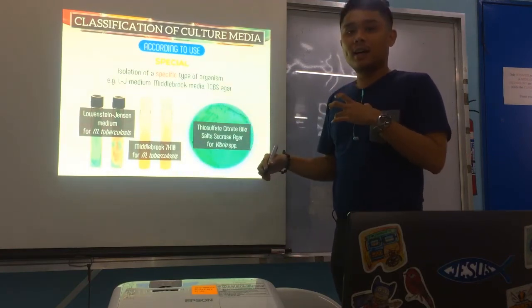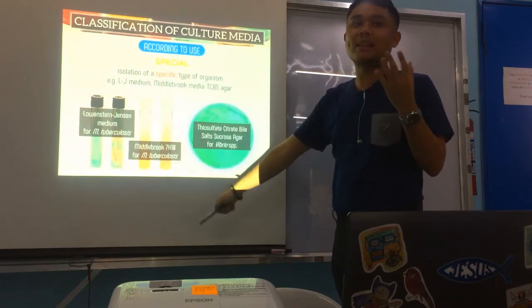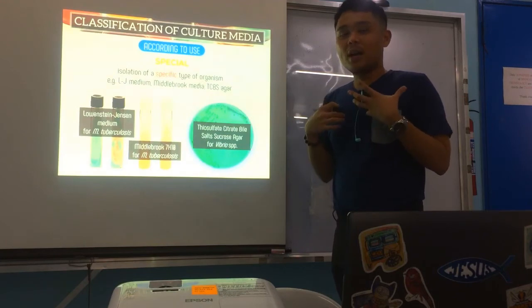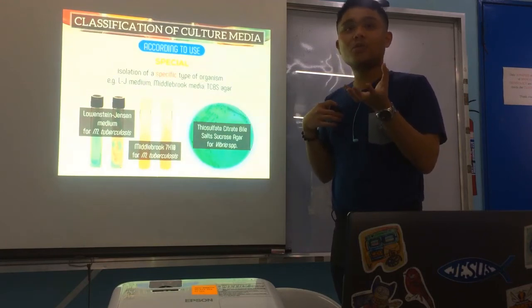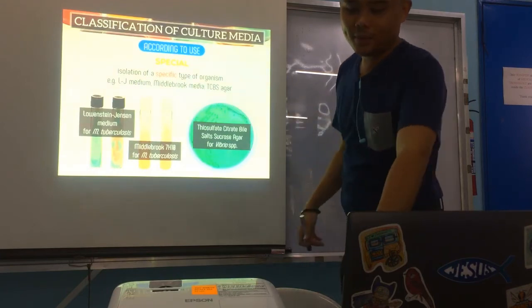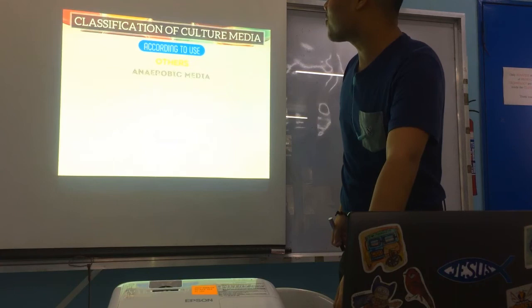Here in acid-fast staining of our slides, right? Because again, it takes a long time to grow. The patient may already have died and the bacteria still haven't grown. So we opt for diagnosis to usually use X-ray and those slides, DSSM. Okay, alright. And of course, you have others.